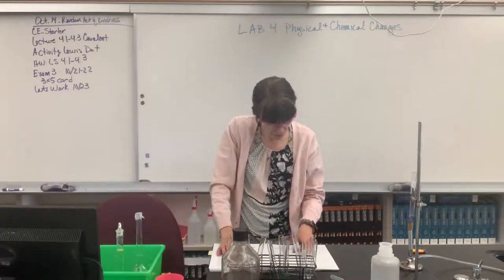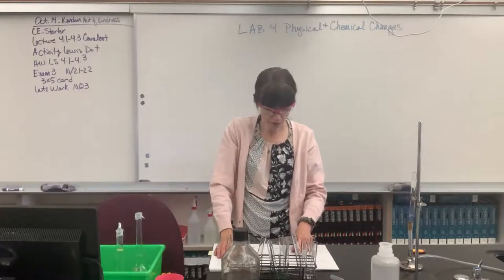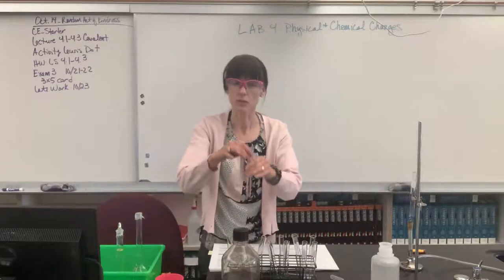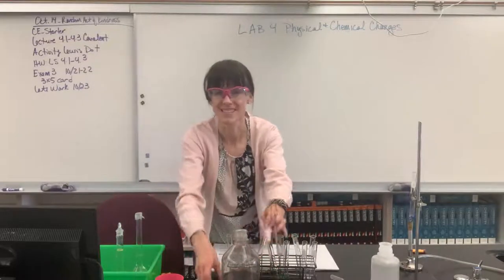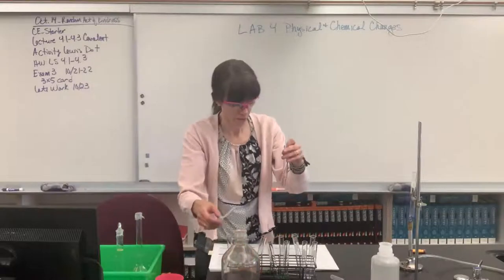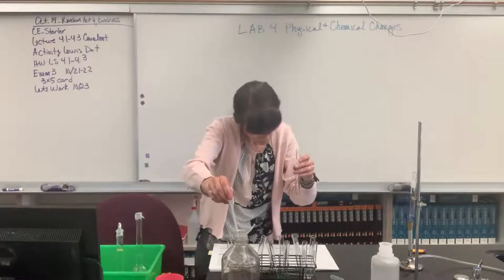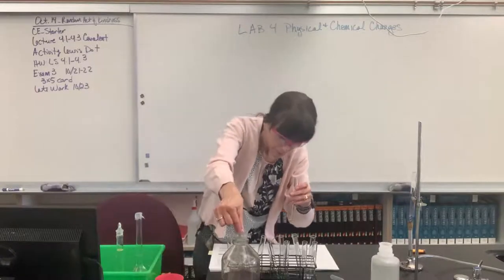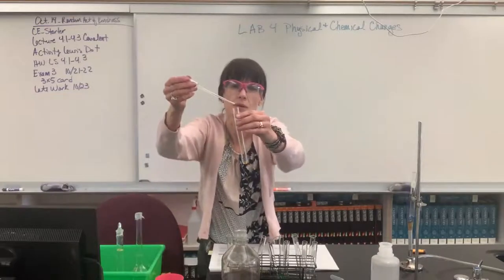We are now on step four. It says add 2 drops of a 0.1 molar silver nitrate solution to one test tube, mix well, record the results. Okay, so let's take this test tube that has 10 drops of the iron 3 chloride, and we're going to add 2 drops. Okay, so let's see what happens. 2 drops.